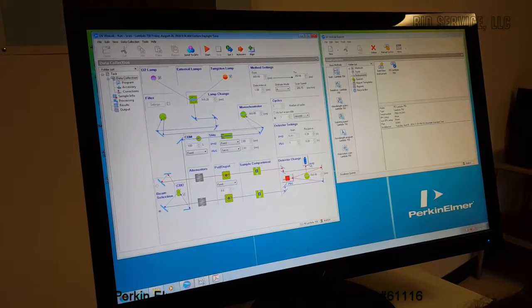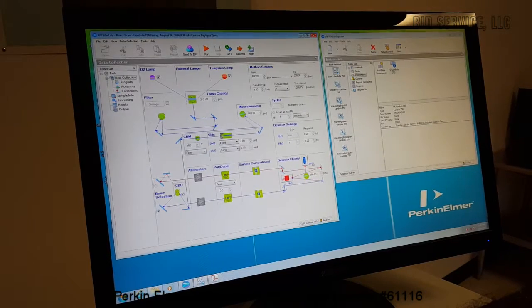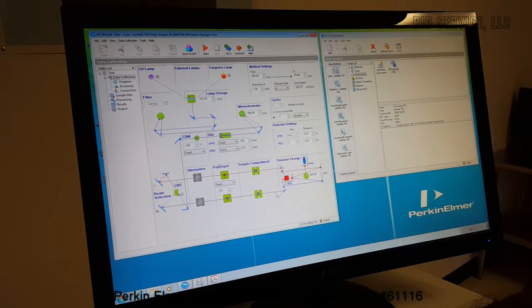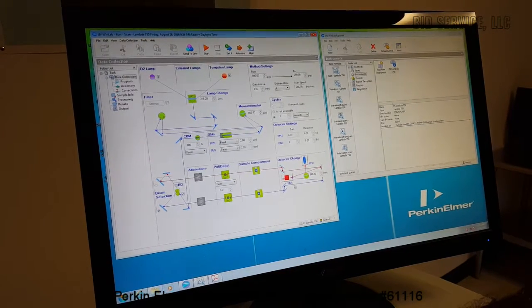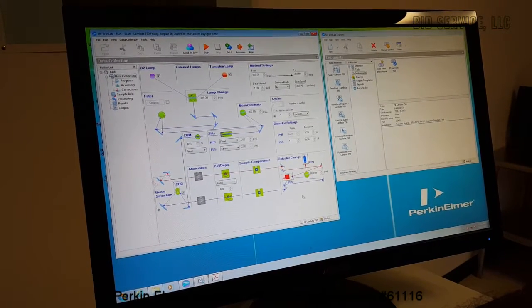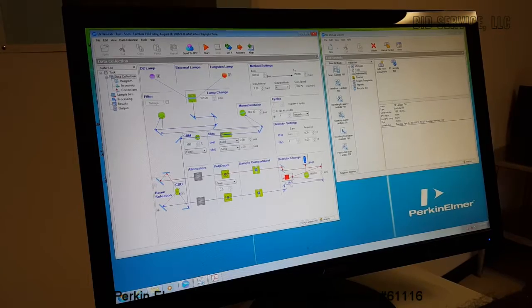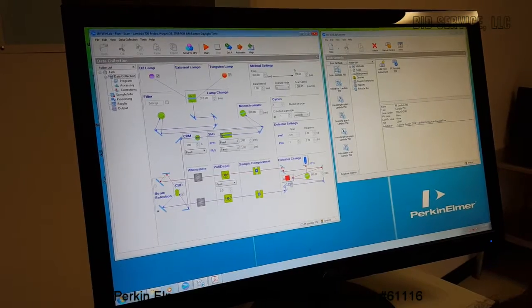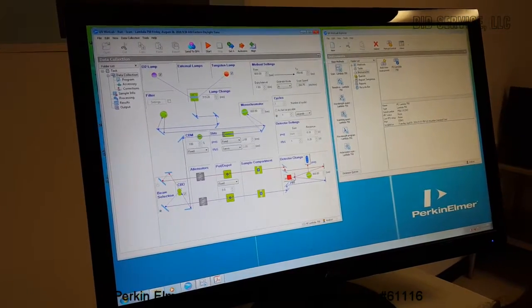There is a photomultiplier tube detector and a lead sulfide detector in the machine. The lead sulfide detector is used for the infrared operations.